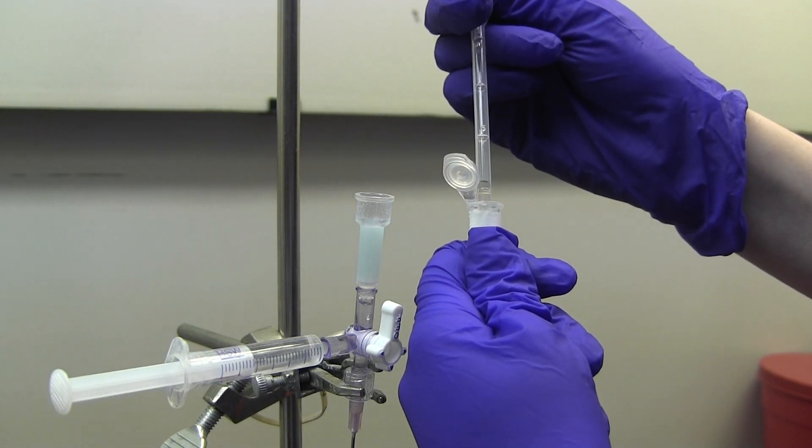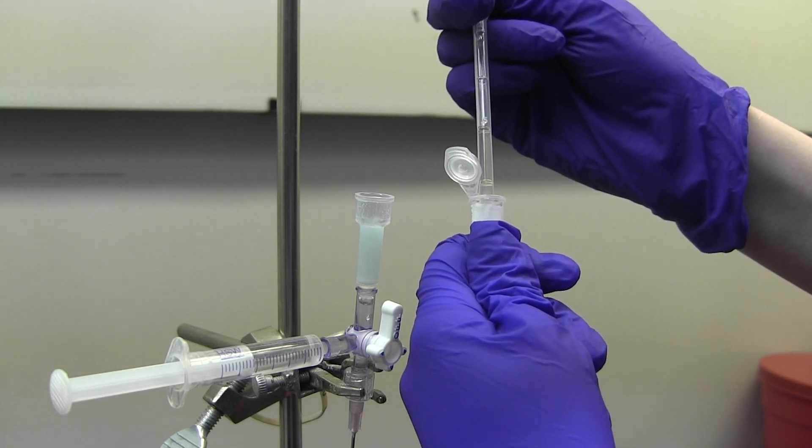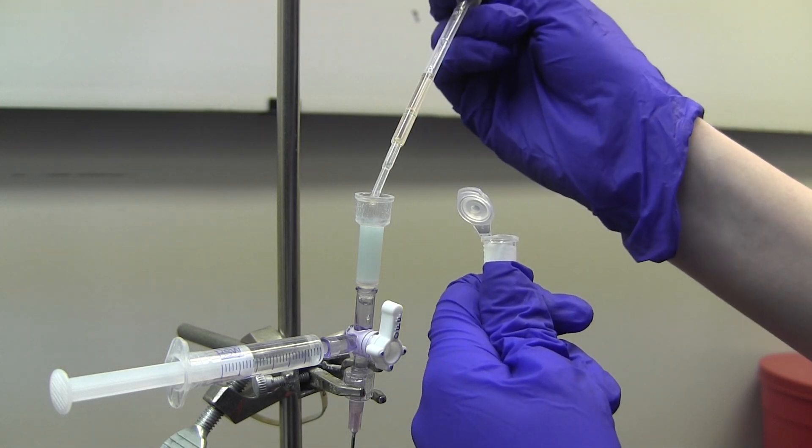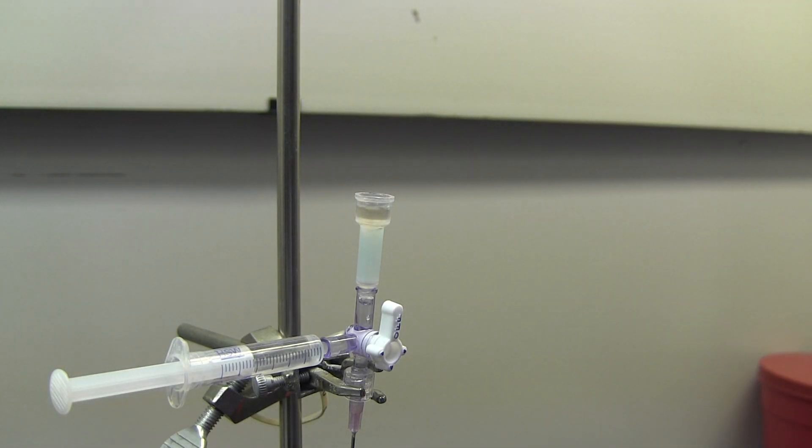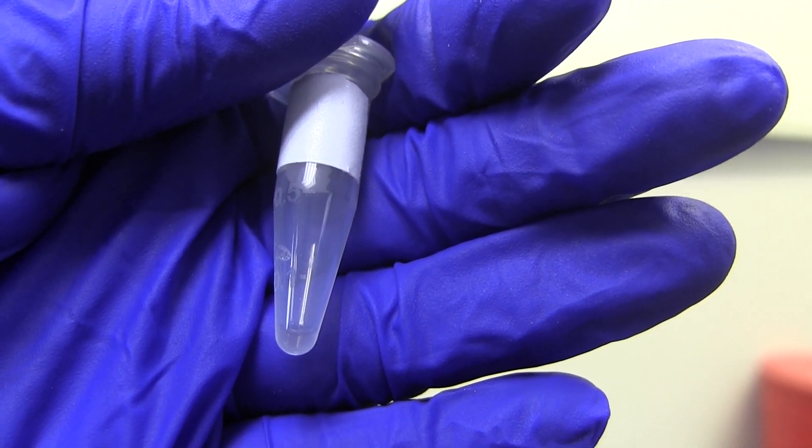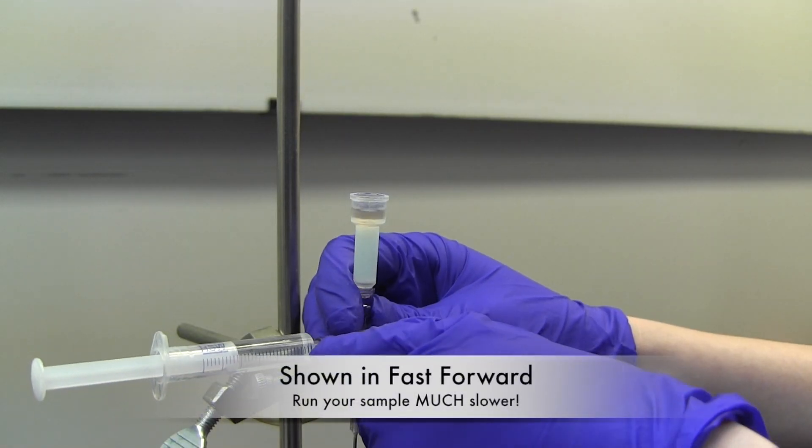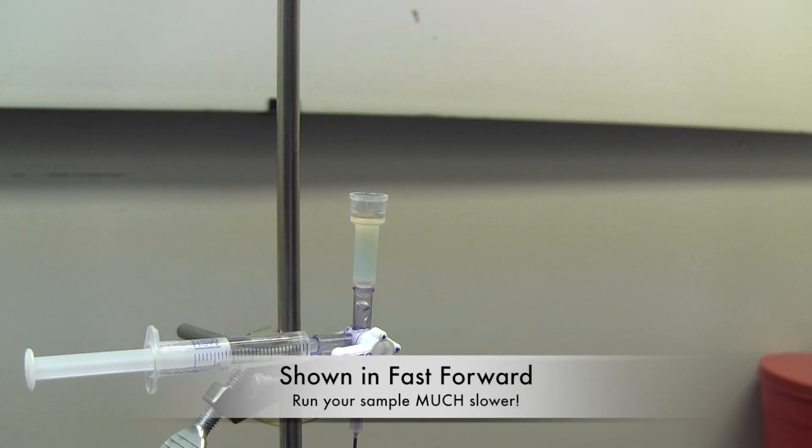Once the column is washed, close the stopcock and remove excess solution from the top. Then, add 0.5 milliliters of your unknown. Make sure to save one drop of your sample. This will be used later in the lab. Allow your unknown to run into the column slowly so there is enough time for the target protein to bind.